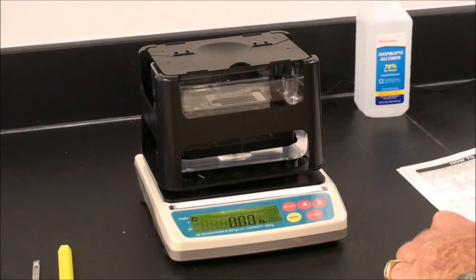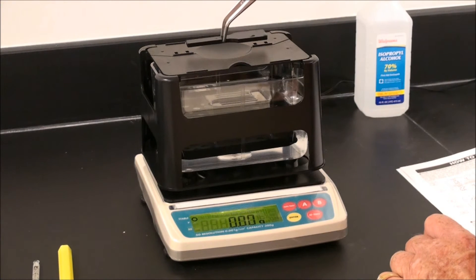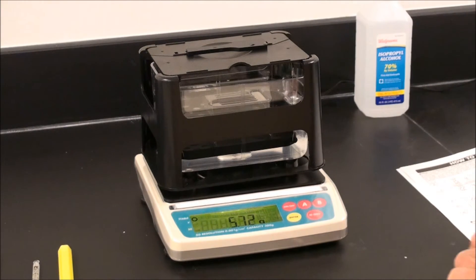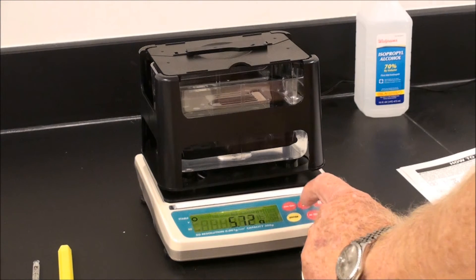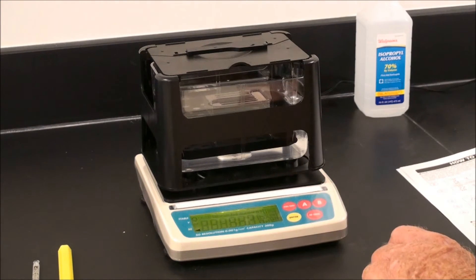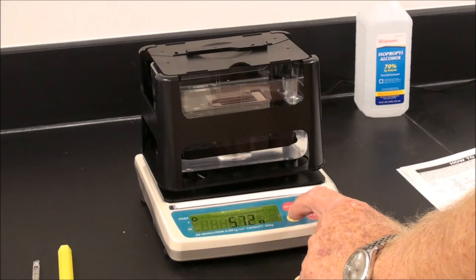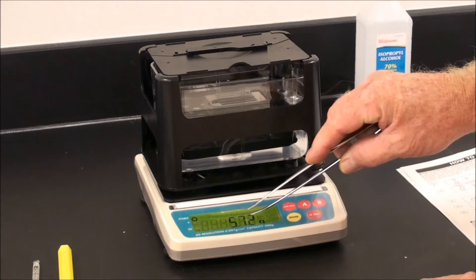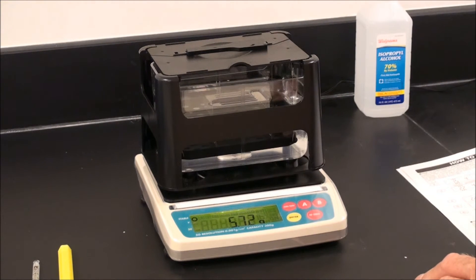Take the sample to be weighed and place it on top — this is called the aerial sensor stage. Allow the stability mark to come up on the balance. Press A gently, and then the ENTER key gently. Five marks will appear, and then the value of the aerial weighing will appear on the balance display.